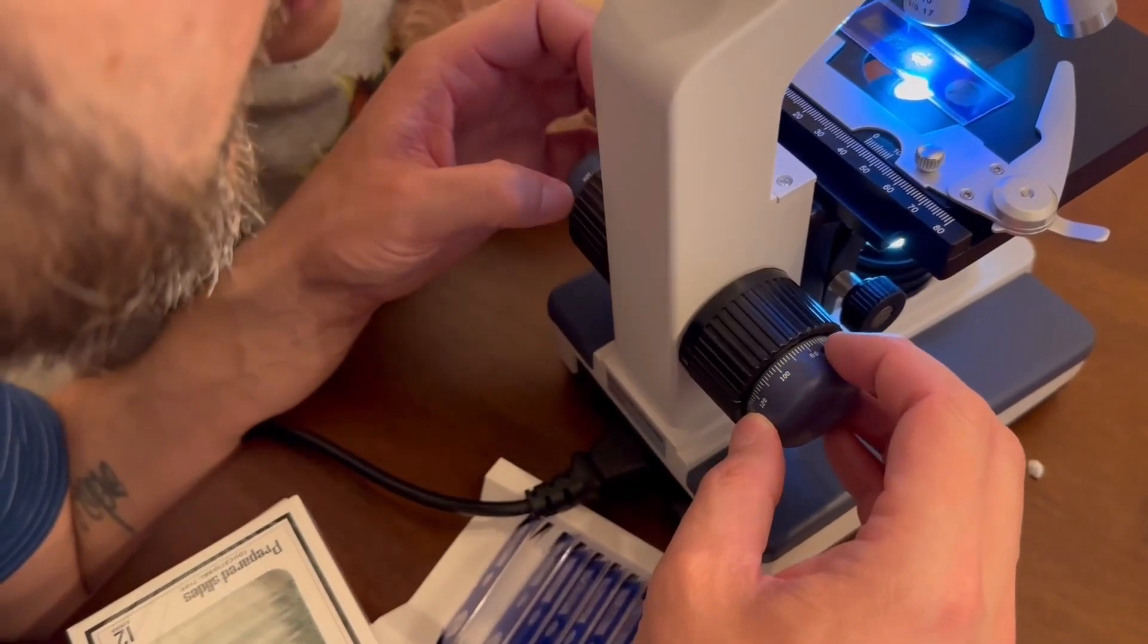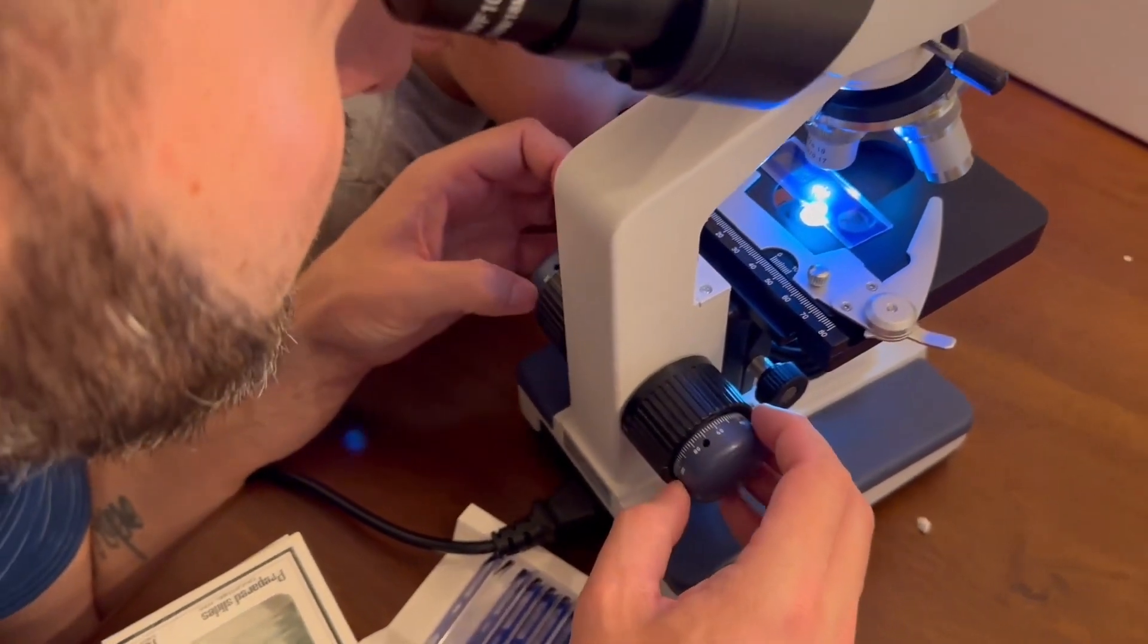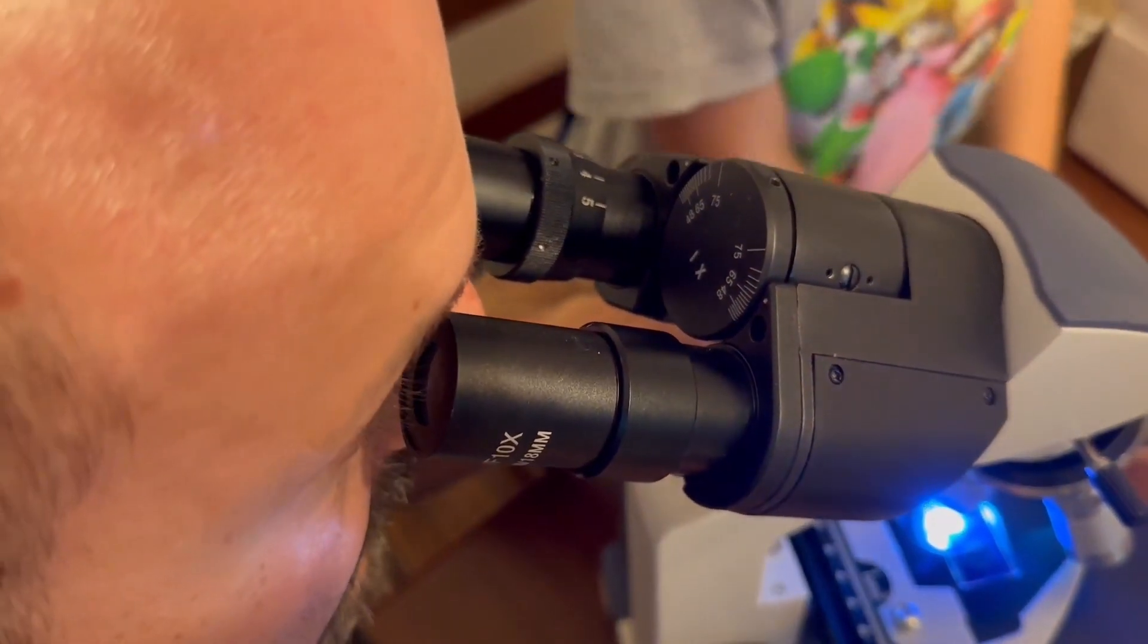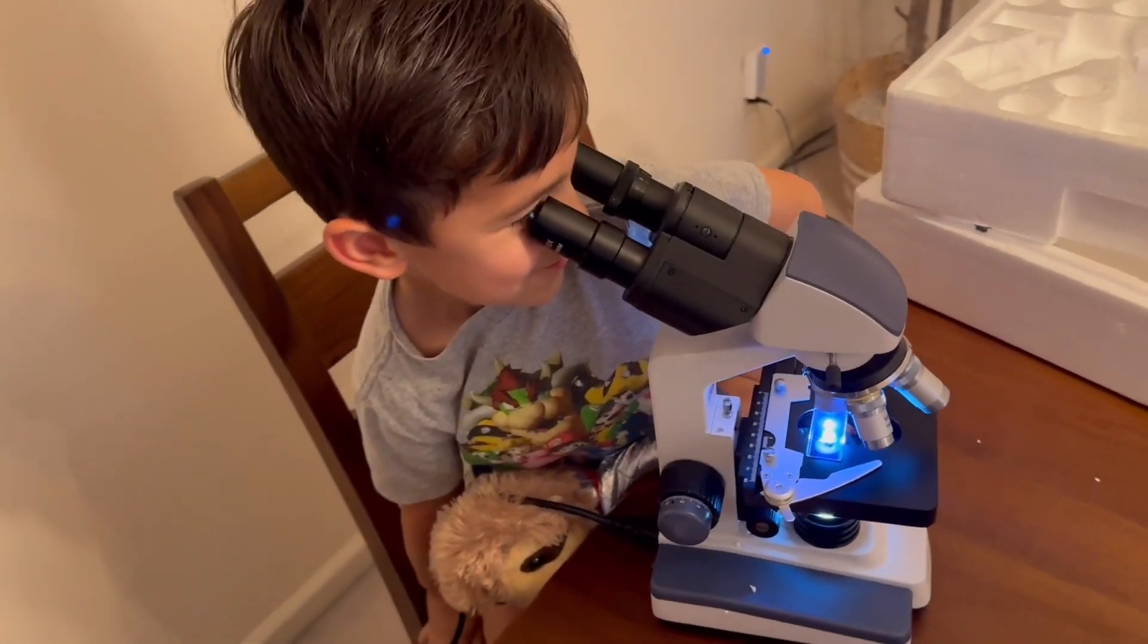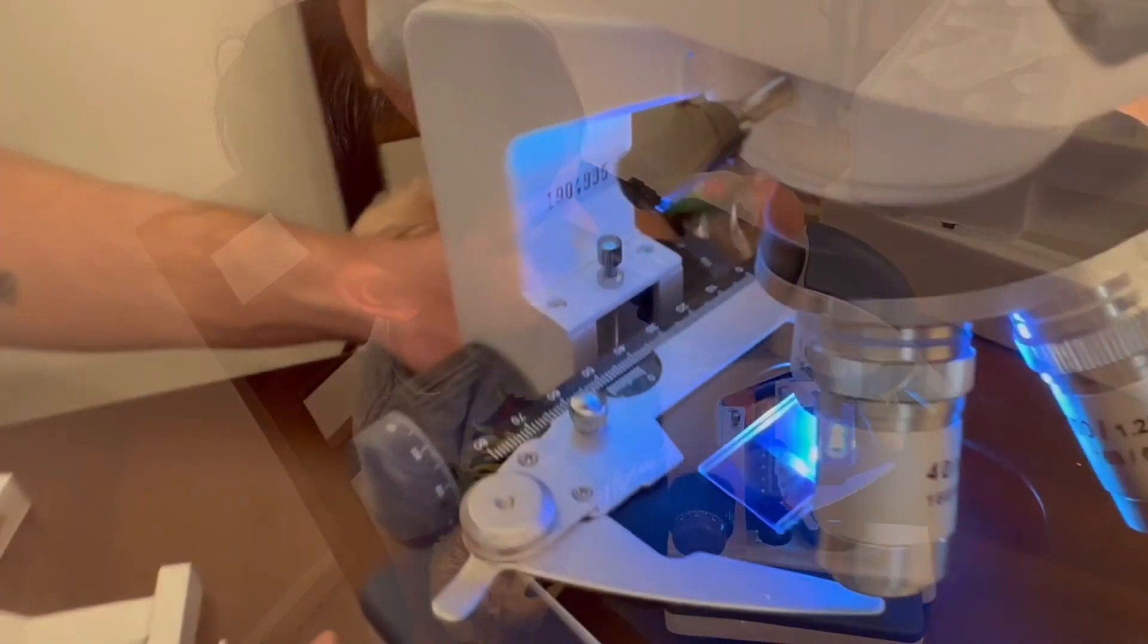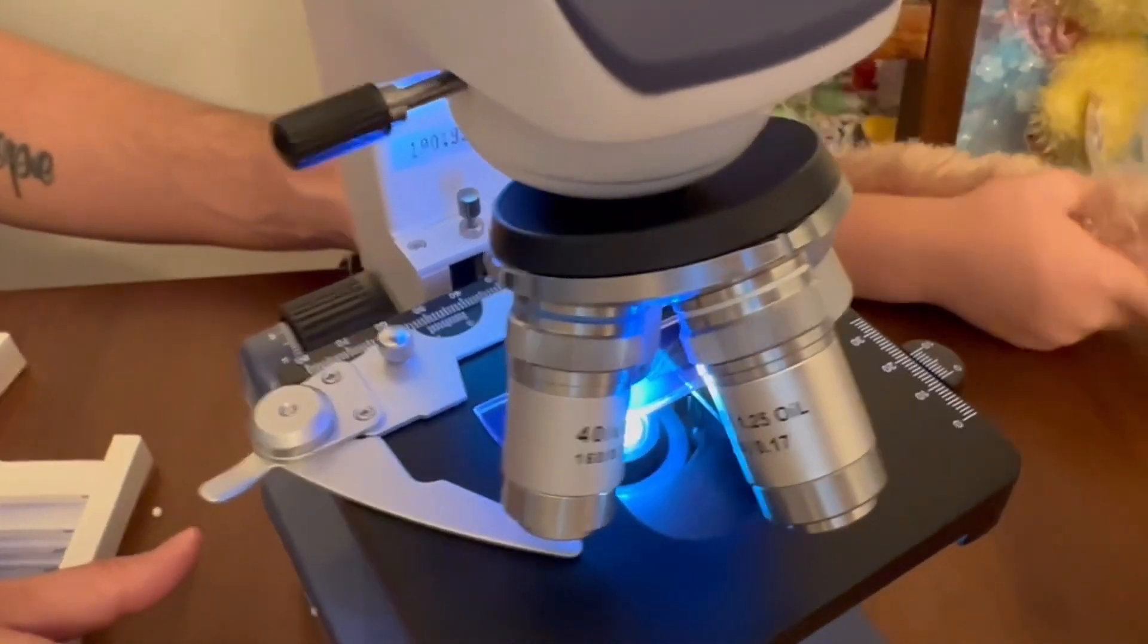Finally, powerful single bulb LED illumination, equipped with a dimmer, allows you to adjust the lighting to your preference, ensuring the best possible examination of your specimens. With all these features, this compound microscope is an invaluable tool for both education and exploration.